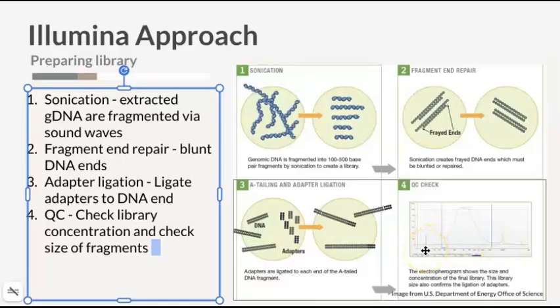If they're too small, you might not be able to get a read that you can align and produce any real detail, because remember that we have the adapter sequences, and the first few bases that are sequenced in the next steps are always a little lower quality, and we'll mention that again later.